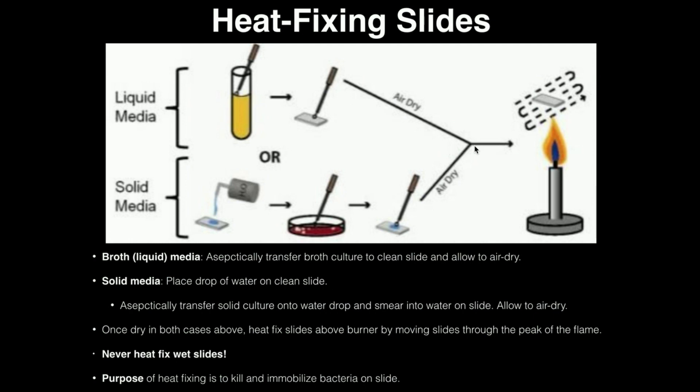Once the slide is dry, you're ready to heat fix. You'll need to light your touch-o-matic burners as we did in day one. Move the slide over the peak of the flame — back and forth — about five or six strokes. You don't want to put it through the center of the flame, just over the top of it about five or six times, and that heat fixes the bacteria on the slide.